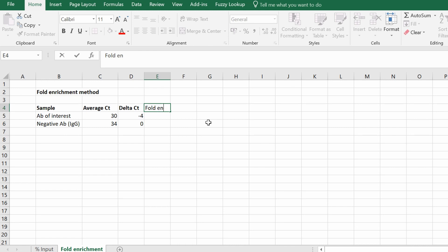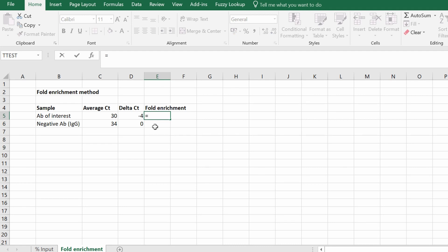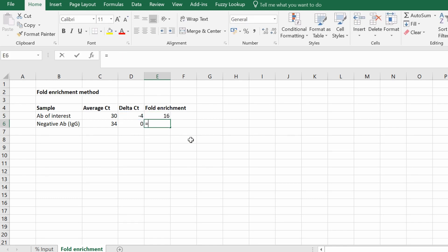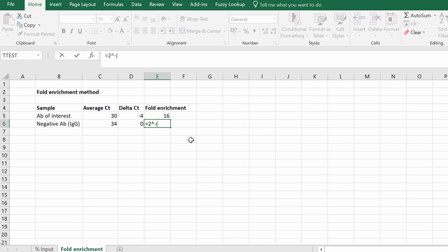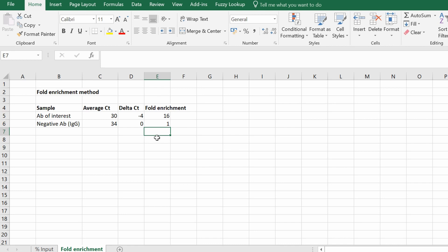Finally, we calculate the fold enrichment for each sample. The formula is: equals 2 to the power of negative delta CT. Press enter and repeat for the negative antibody. When you do this for the negative antibody it will always equal one, so the fold enrichment for the negative antibody should be 1. In this example, the fold enrichment for the antibody of interest is 16-fold greater than the negative antibody.